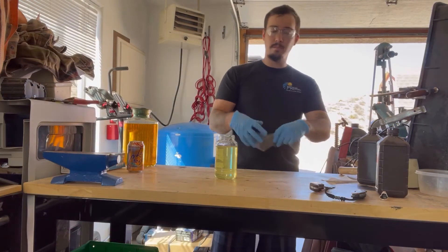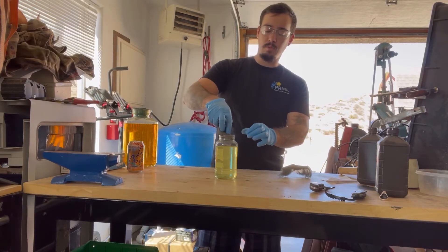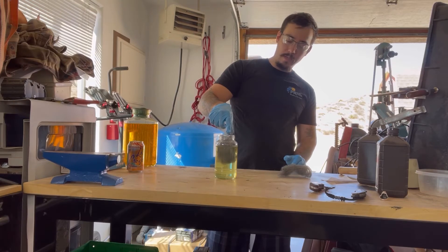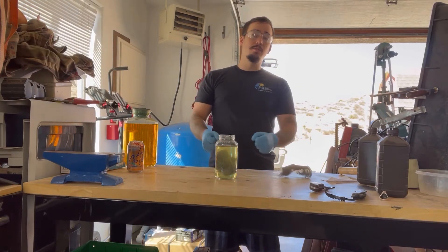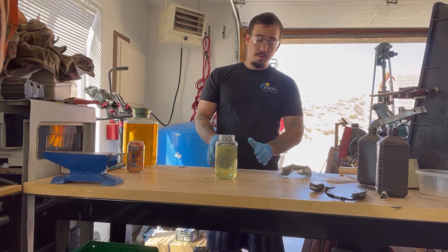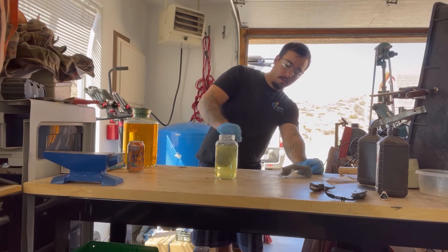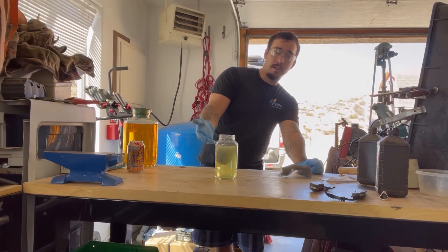What we'll be doing to the muriatic acid is adding a piece of steel wool. As that steel wool breaks down in the muriatic acid, it's going to essentially add iron ions to the muriatic acid, creating what we call ferrous chloride. That's one step away from ferric chloride, but we'll get to that. As this breaks down in the acid, which should take a few hours, we'll begin to see reactions happen. We'll be back in a few hours.